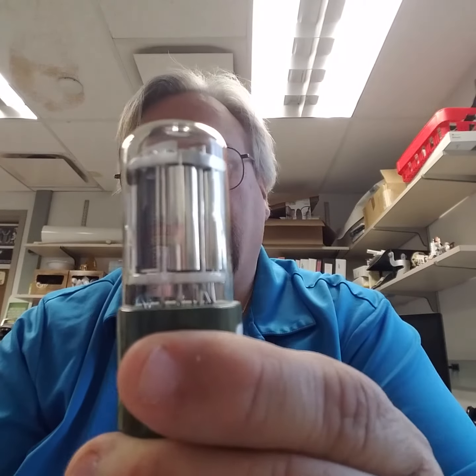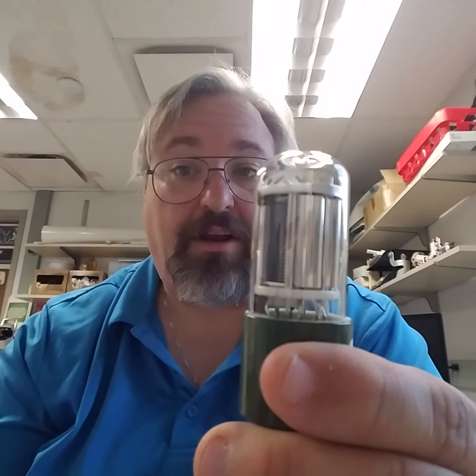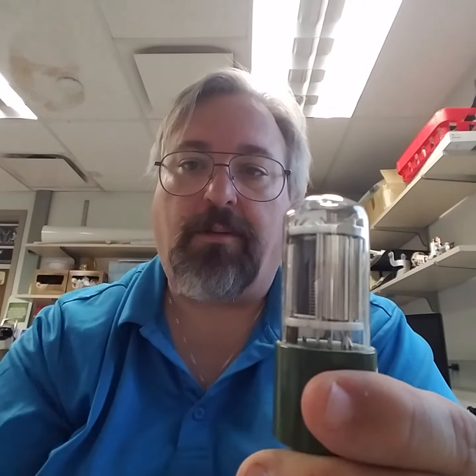Well, let's start at the beginning. Your detection system is typically something like a PMT or an APD. This is a PMT. These systems will capture any light, any photon of light that hits them, and amplify that signal to generate an electronic pulse. So we need to control and attenuate what photons are coming towards this. And we do that in two ways. We have mirrors, like this long pass mirror here, and filters.